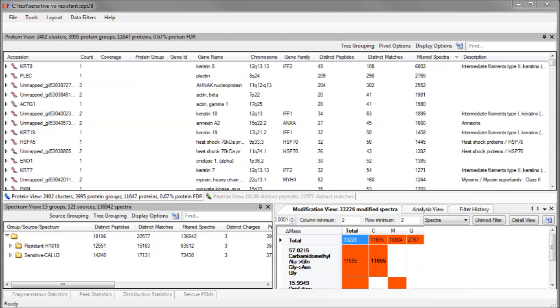Right now, that's all there is to it for gene-level data inside IDPicker. Check out the NetGestalt tutorial to understand how gene mappings allow easy export of IDPicker reports to NetGestalt.